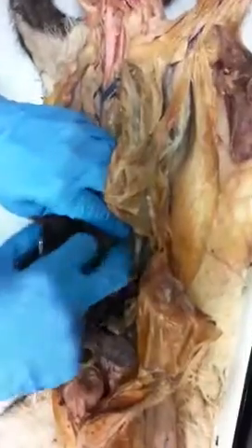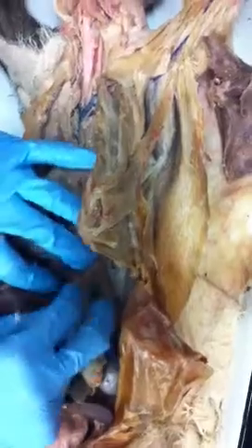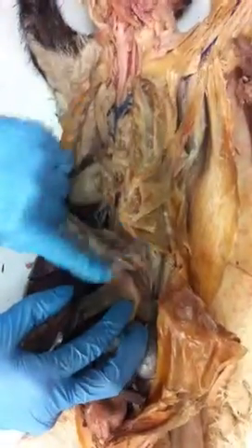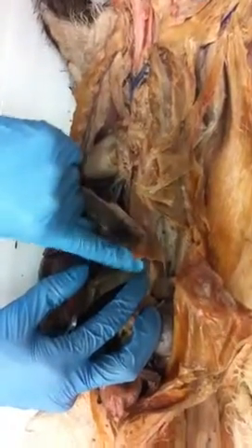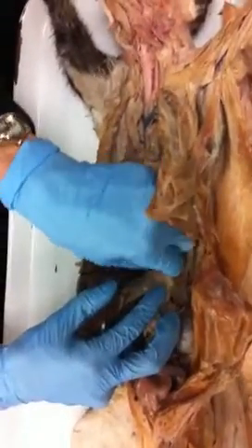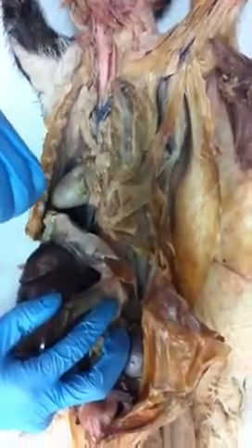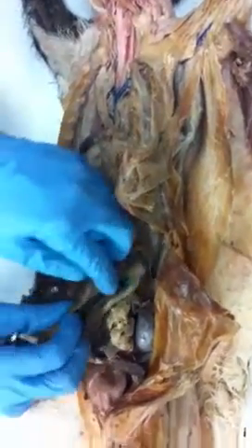Okay, so if we go on the other side here of the diaphragm, and we tear this out a little bit. Right here is where the esophagus is coming through, and it's meeting the fundus of the stomach, the first part of the stomach. Okay, so here's the esophagus, this is the top of the stomach. Okay, and if you can feel in here, I can't really feel it too well in this one, there's a sphincter muscle right there where those two meet. Once the food goes into the stomach, that sphincter closes to keep food from flushing back up into the end of the esophagus. Okay? So now we're in the stomach.